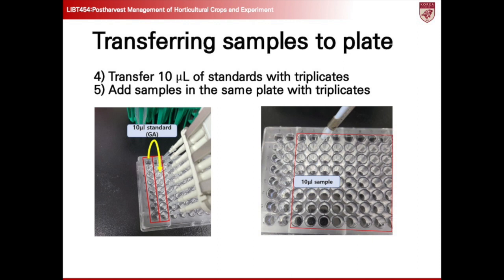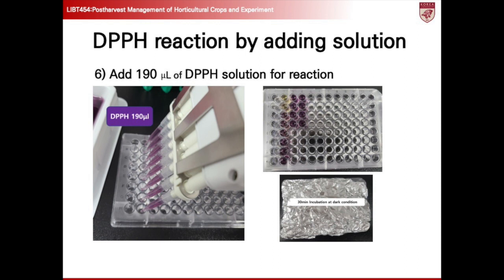Pipette 10 microliters of the standard solution and add it to the second column of the microplate using a multi-channel pipette. Then, pipette 10 microliters of each sample into separate wells, ensuring to include multiple replicates as needed for robust analysis. For each sample, add three replicates side-by-side to ensure consistency and reliability in the results. Add 190 microliters of DPPH solution to each well of the microplate containing the standard and sample solutions, ensuring that each well has an equal volume of DPPH solution for consistent reaction conditions.